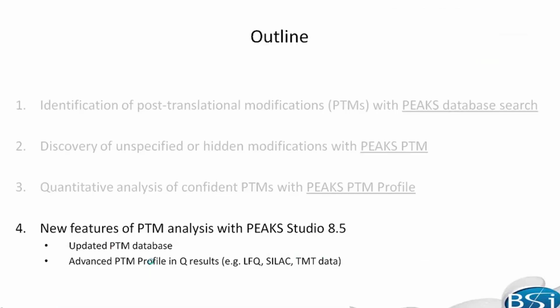Okay, so up until this point, everything that we've seen will be included in the identification package of PEAKS. While PEAKS PTM, so PTM profiling, is a quantitative tool, we still include that within the identification package of PEAKS. So we have some further PTM analysis within the Q module that you can use to do some extra analysis.